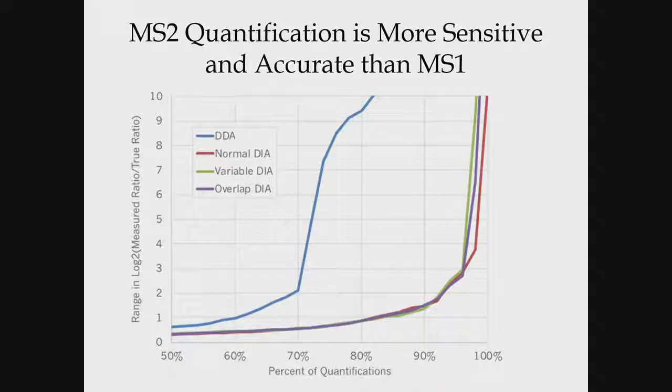If you wanted to use 5, and you have interference in any one of those 5, you can choose another set of product ions to use for quantitation. So this assumes it's looking for product ions without interferences, and even if you have a poor product ion resolution, you can pick other product ions that give you a good reflection of the quantity.